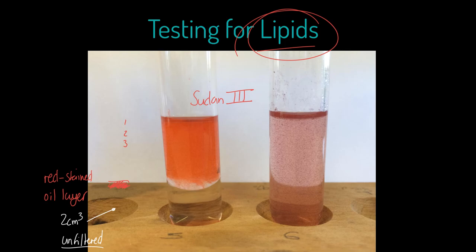So here we go. Kind of ended up with the layers in the wrong way. Over here on the right-hand side, what would we argue here? That here there are no lipids present. And here we've got our red-stained oil layer. Yes, here we have our lipids present.